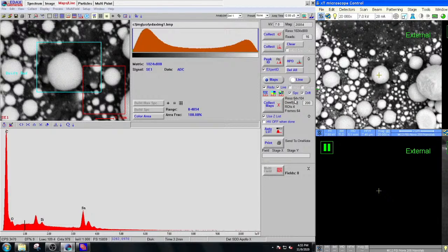So in reduced mode, you set the resolution based on the number of pixels in the box, but the pixel size comes from the full area mode. So if you had it in 128 mode, that kind of dictates how big the pixels are in your reduced area mode. I think you can change that though. So when we hit collect, we can upgrade that.